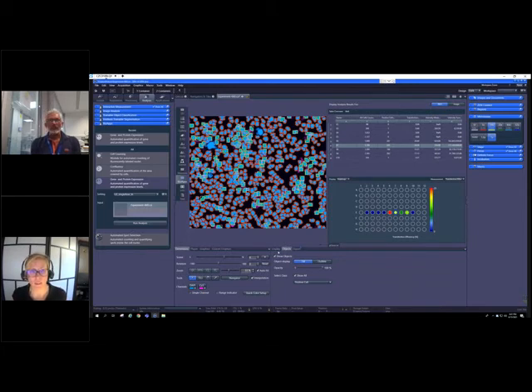Yeah, so we have this 128 LEDs due to some patent reasons. It could have been one more, give or take. So we do them one by one. So quick you don't see it, taking 10 seconds or so, and you get this overlay of 128 images as this composite dark field image at the end. It's already composed once you're done with this, right?